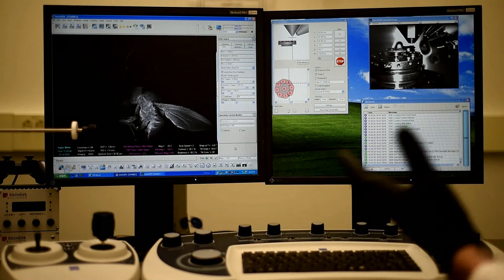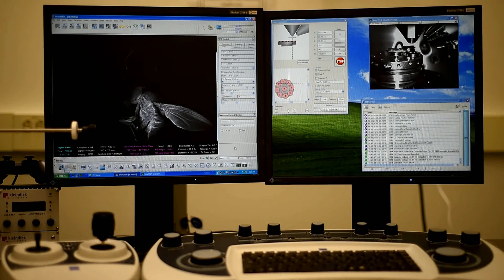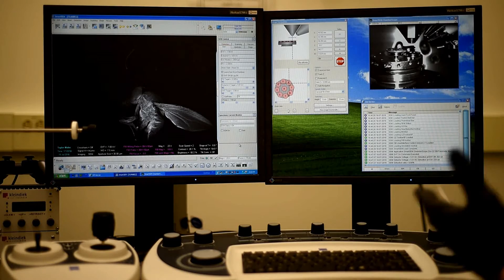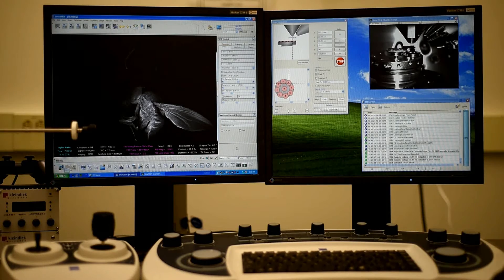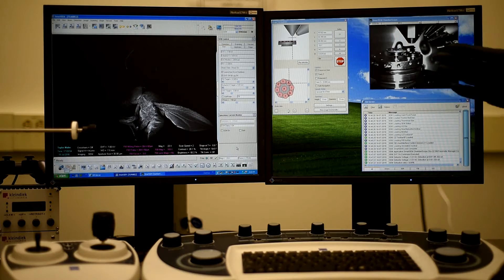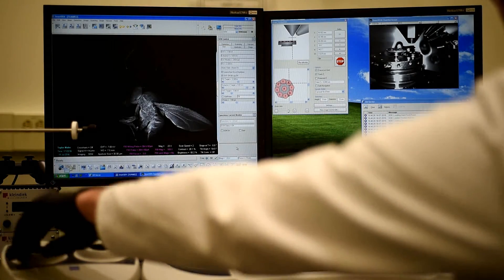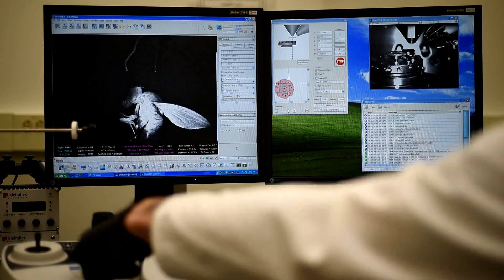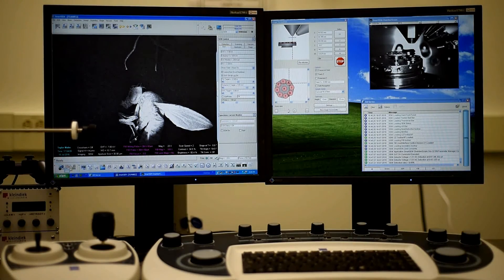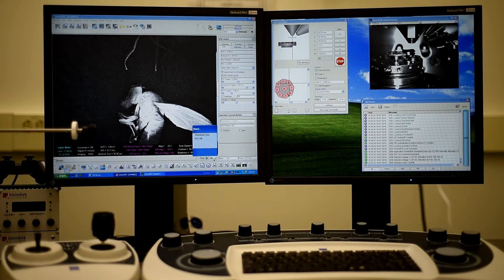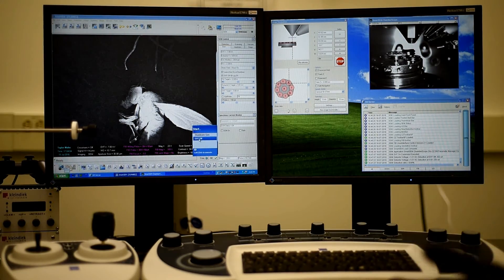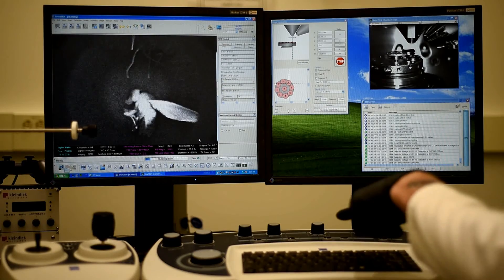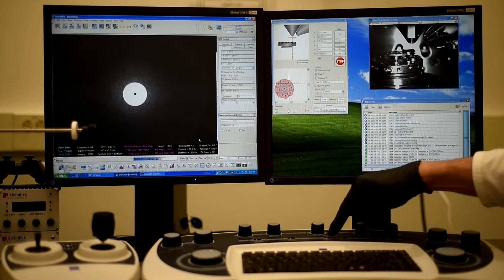So if we're done with the session, what I typically do to shut it down is I first look and make sure that my working distance, I'm not going to crash into anything. I like to lower that. You can decrease the Z with that joystick. You can click on the All button and turn the EHT off. And then hit the Exchange button on the keyboard, which is here. And that will move this to the home position.